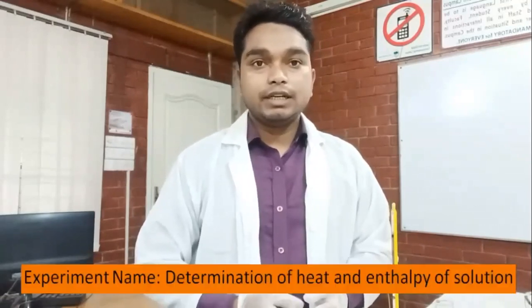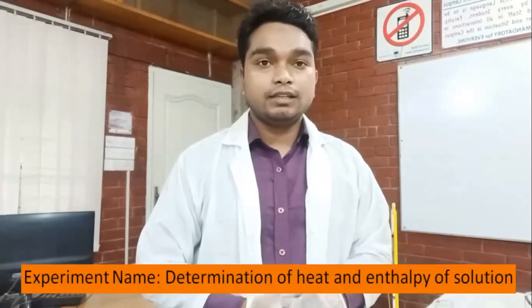Today we will do an experiment. The name of the experiment is Determination of Heat of Solution and Enthalpy of Solution.